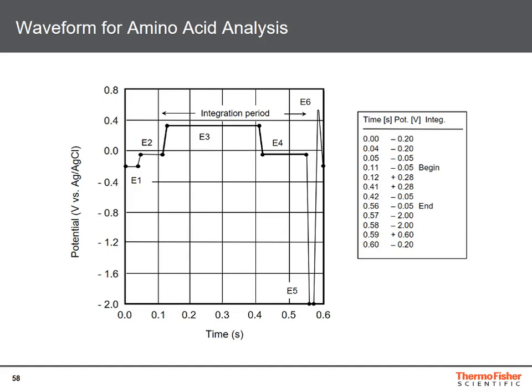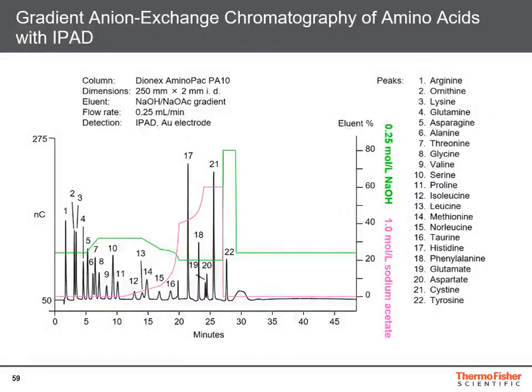Applying this 6-potential waveform, we can detect amino acids directly down to the picomole level. Integrated pulsed amperometry has somewhat revolutionized amino acid analysis.